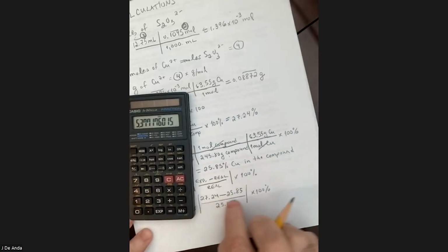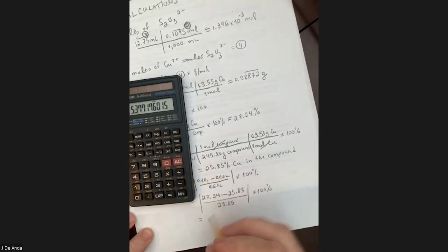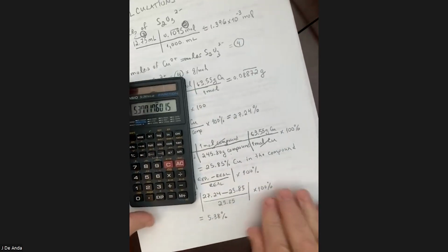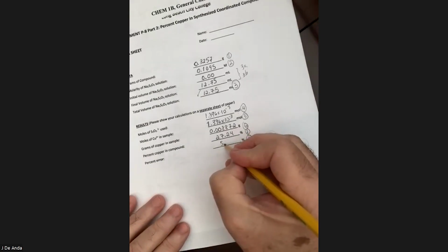This number here, I don't know if you recall, was only good to about 3 sig figs. So we're going to say that this number is going to be 5.38%. And that is the value we're going to bring back to our data sheet. And there we go. This is now 5.38%.